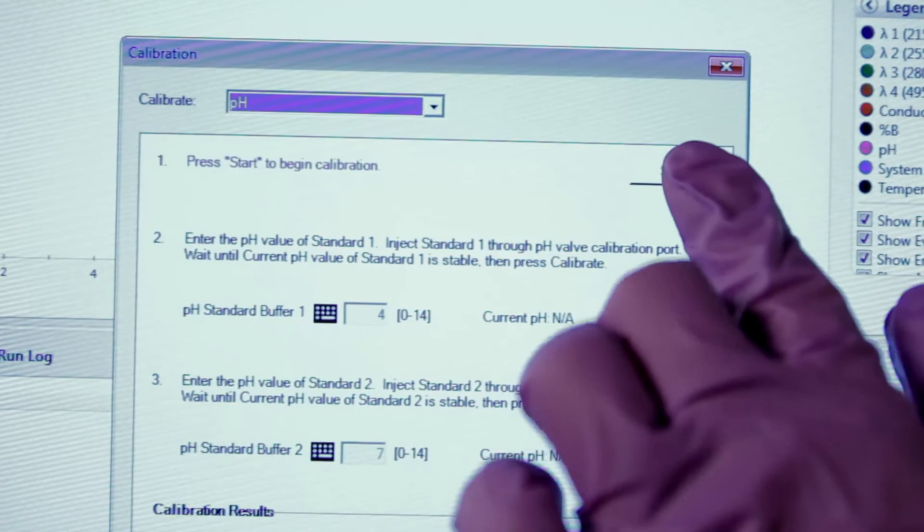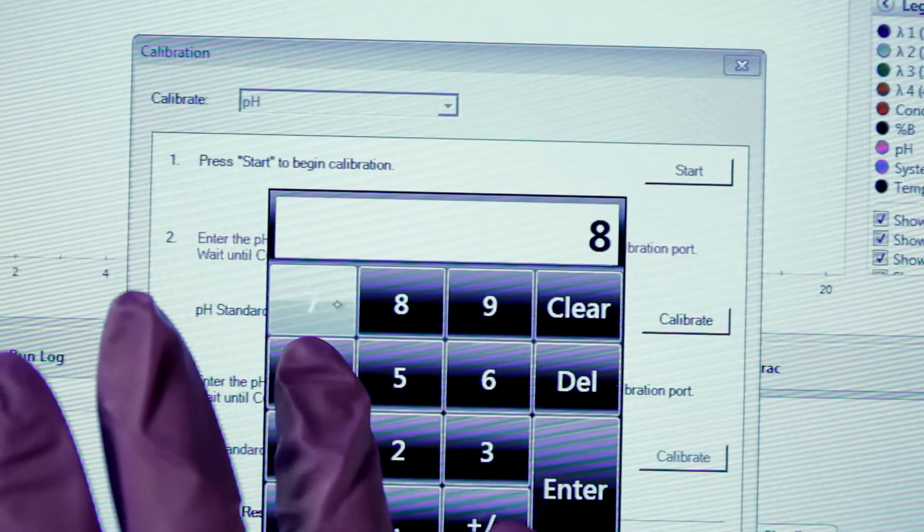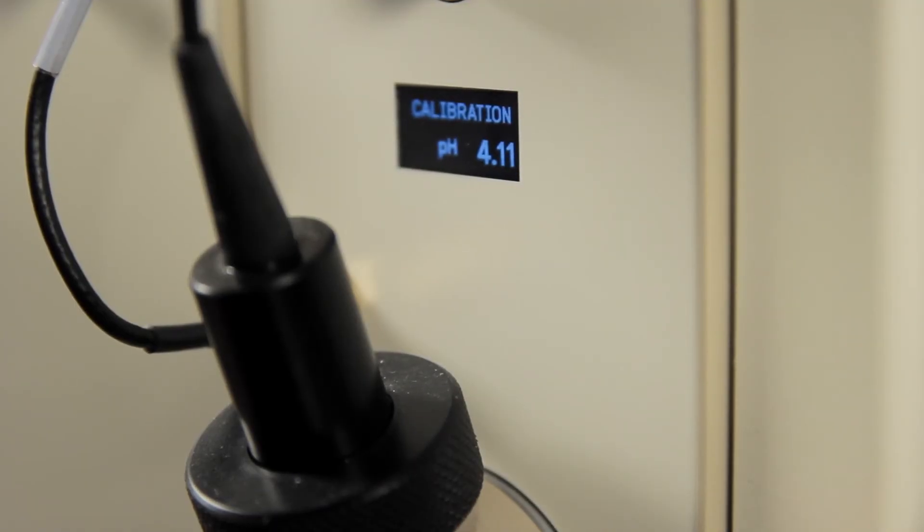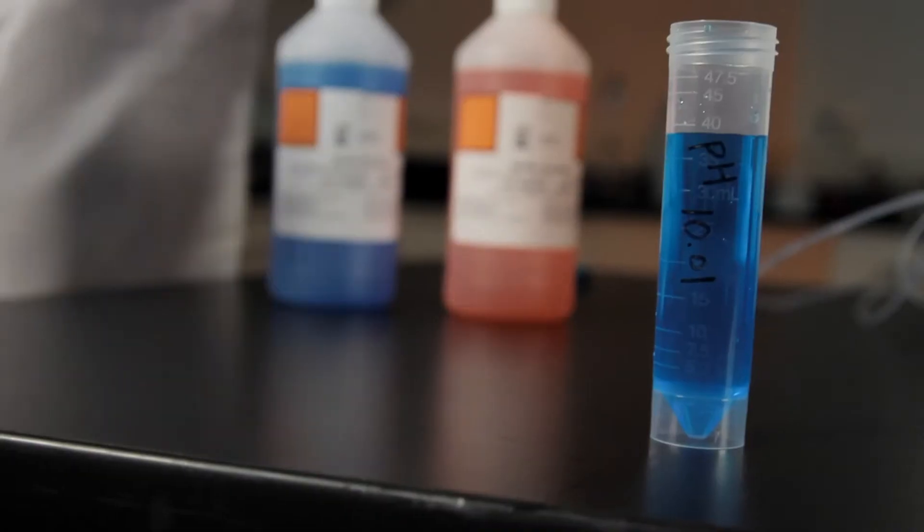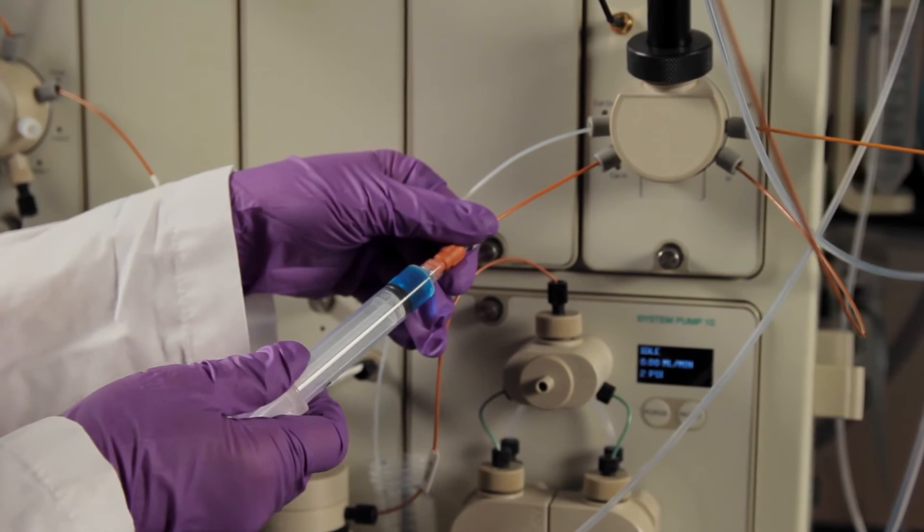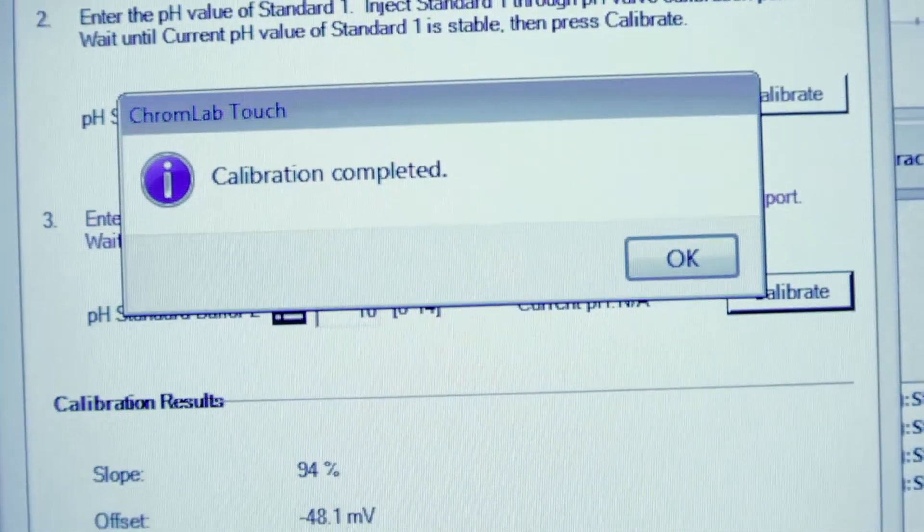Press Start and enter the pH value of your first standard buffer. Once the current pH value is stable, press Calibrate. When finished, repeat these steps with the second pH calibration solution.